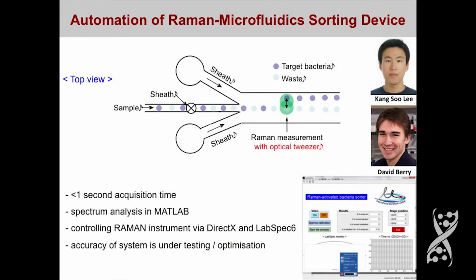So Kang-Soo Lee and David Berry wrote a MATLAB script and an automation which can control the Raman instrument. And this works out quite nicely now, but we are beginning the accuracy testing of the system and, of course, to optimize it to various cell sizes.